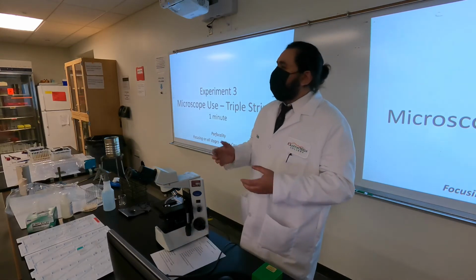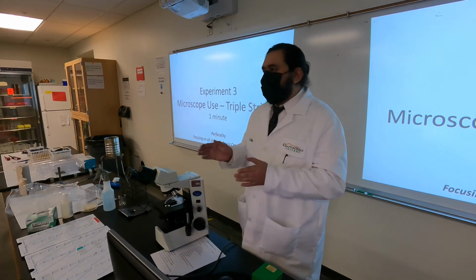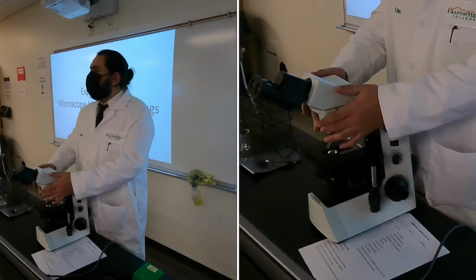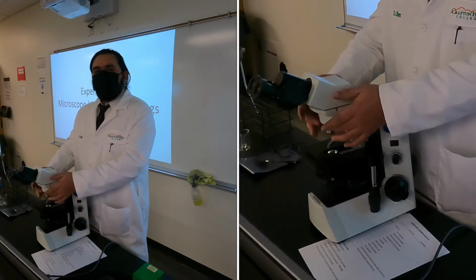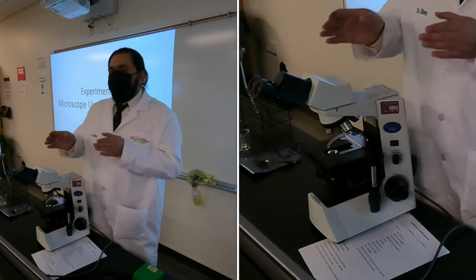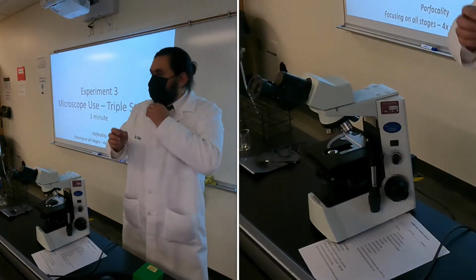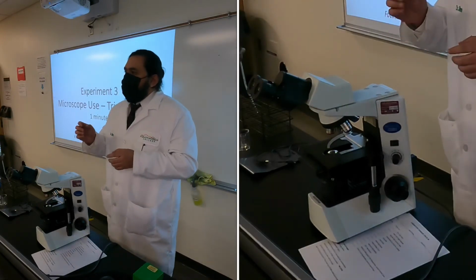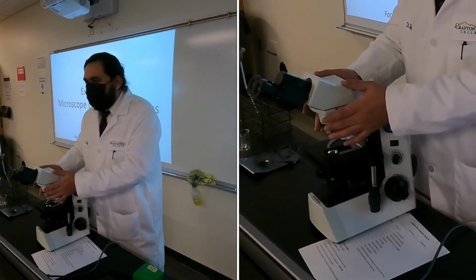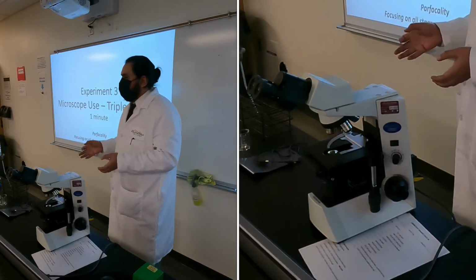Now, to make sure we are trusting our instincts, let's move from this stage to the next one. So let me demo, and then you follow. We're only going to use our revolving nose piece, the little ridged black rim of rubber that we have over here. Don't touch the objectives. We're going to move from the red one, the 4X, to the yellow one, the 10X, okay? And so you'll see it snap in place. Again, don't touch the objectives, only the revolving nose piece. And you should be able to get a closer view of those three strings.